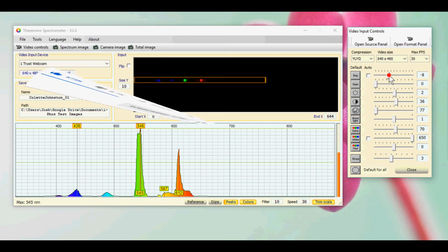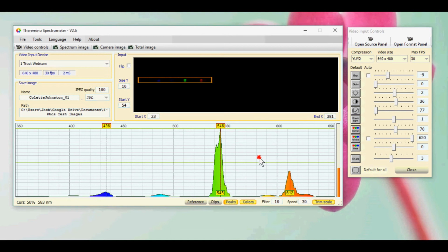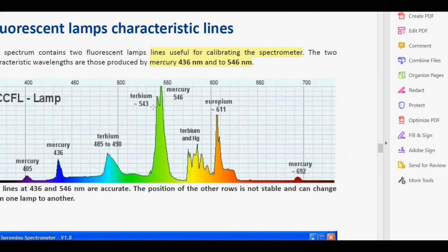Specifically, we'll see that what we thought was a single green line is actually 2 lines, and this lower line is terbium. There you go, terbium. So it would be easy to align on that, and it would give you these two peaks about, well, in this case it's showing 7 nanometers apart, and a similar but slightly smaller displacement there.